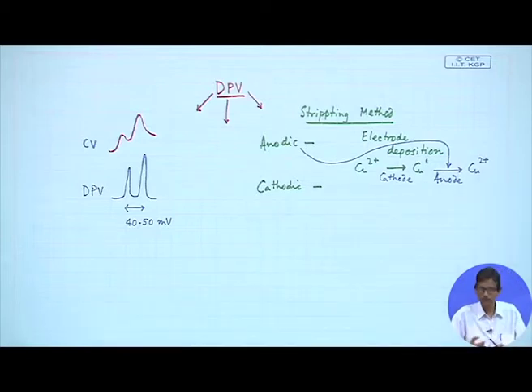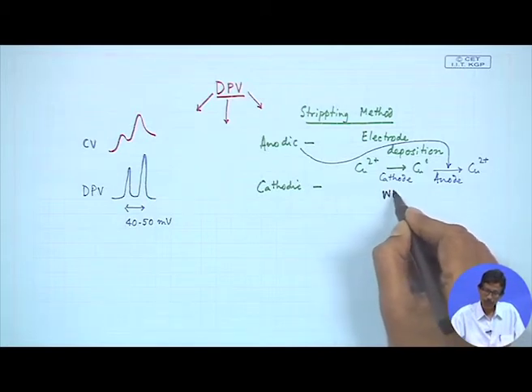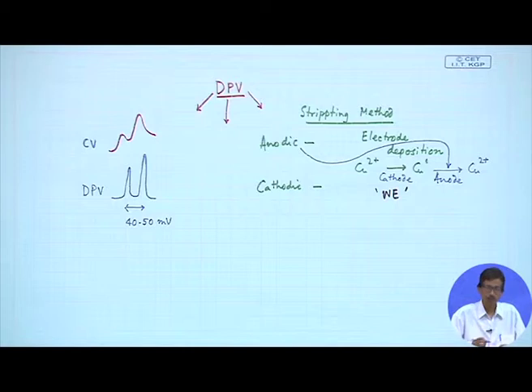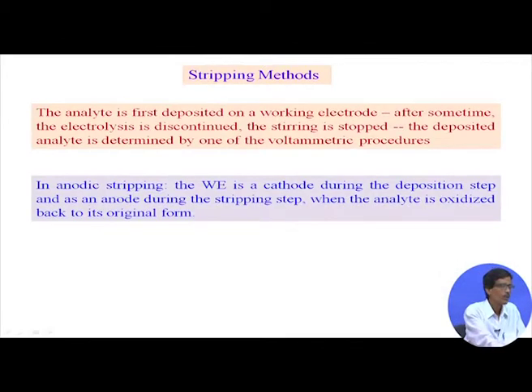We should also be very careful: forget about your reference electrode, but you have the working electrode and the counter electrode. The working electrode is the electrode on which all these things are happening.